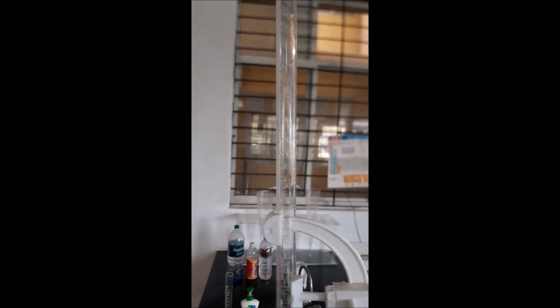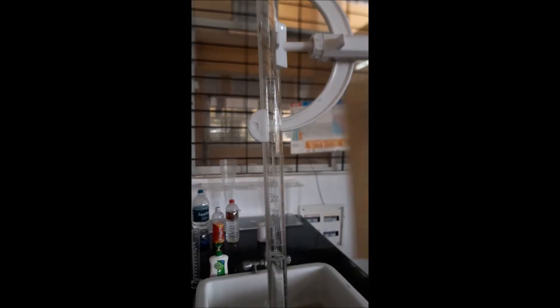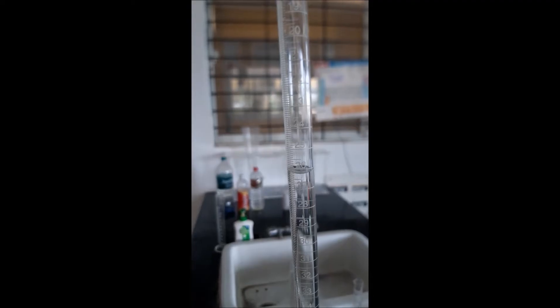Take down the initial reading — initially we had filled the burette to 0. After the titration, the volume of EDTA consumed is 26.3 ml as the final burette reading. This value will be used to calculate the B1 value for the sample of tap water.